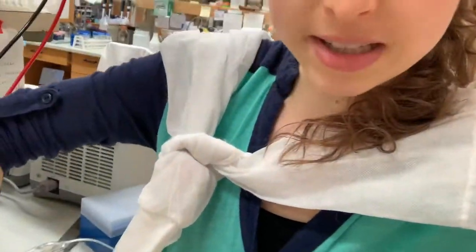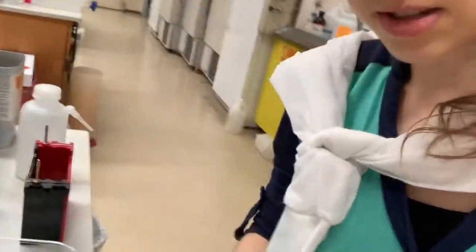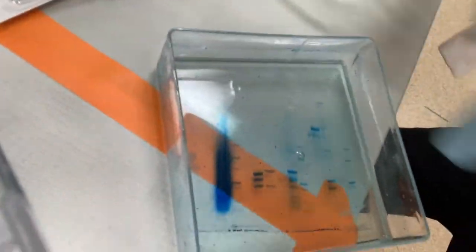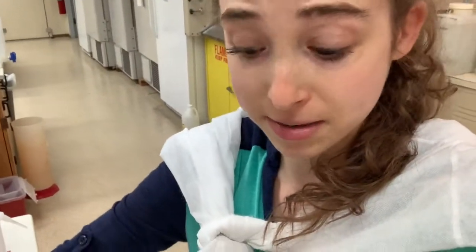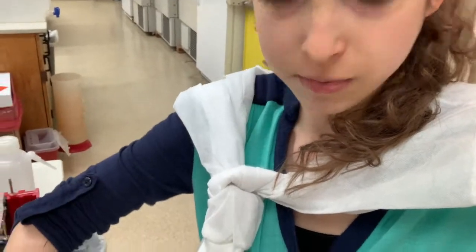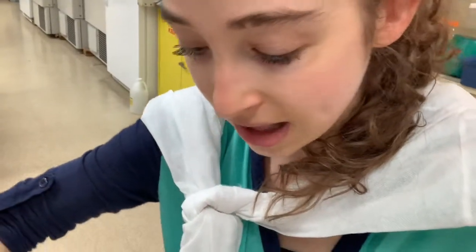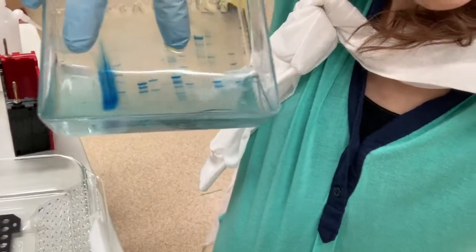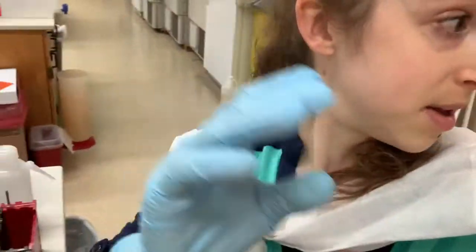The problem is that you can't really see the proteins because they're invisible to us. But what we can do is a stain — an all-protein stain — so you get something that looks kind of like this. You can see that the gel is this really thin thing that's kind of hard to work with, which is why we're going to transfer the proteins to a membrane. Right now you just see a bunch of different bands or a smear, and you can't tell what band is what. So we have a size ladder on the side with known proteins of known sizes that you load along with your samples, giving you a relative estimate of the various protein sizes.